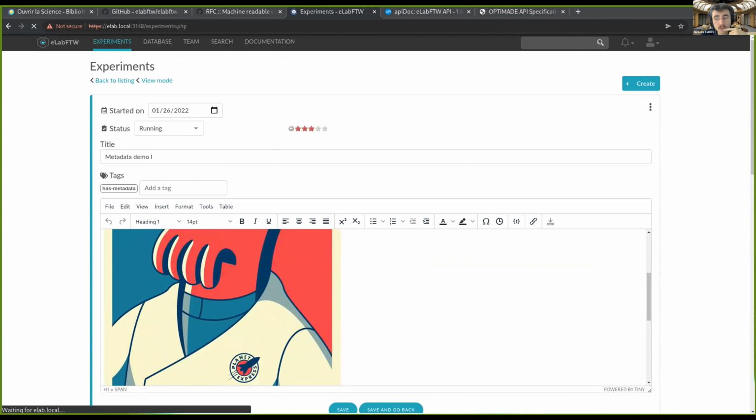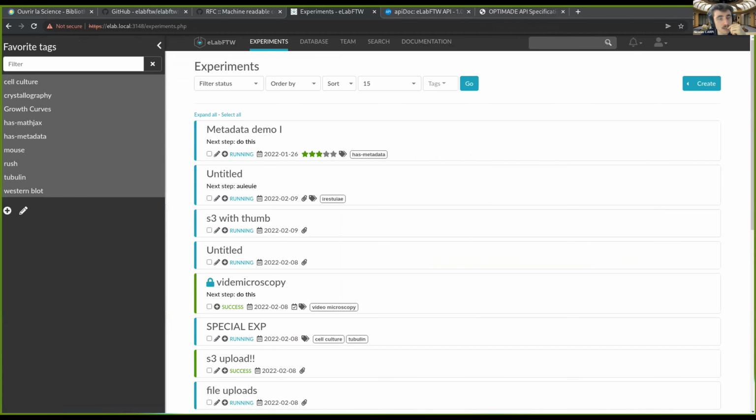Basically what I want to achieve in my head is to have some sort of homogenization of the different APIs for the different ELNs, so that you can query an experiment regardless of where it's stored, if it's stored in Kmotion, or in eLab, or in Synode, or any of the other proprietary ELNs.